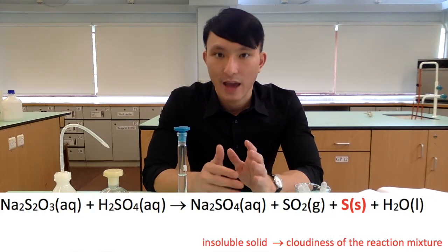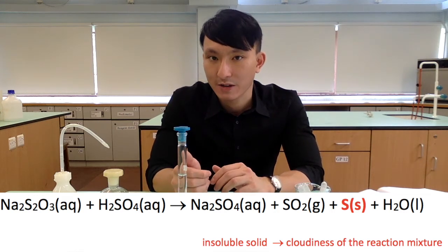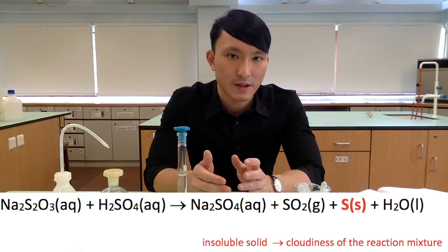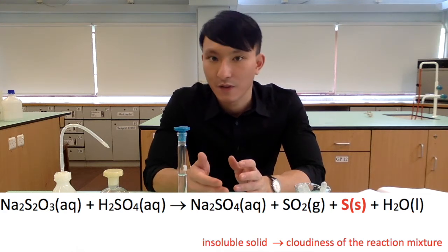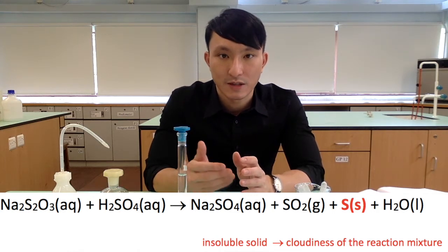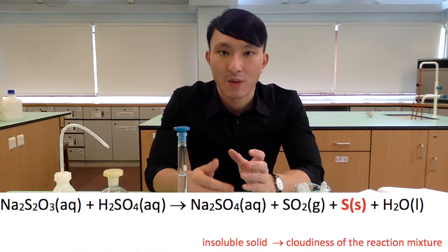In this reaction, sulfuric acid and sodium thiosulfate react to form several different products, and one of the products is sulfur. Sulfur is insoluble in water. Therefore, as the reaction proceeds and the insoluble sulfur keeps being produced, the reaction mixture will become more and more cloudy.